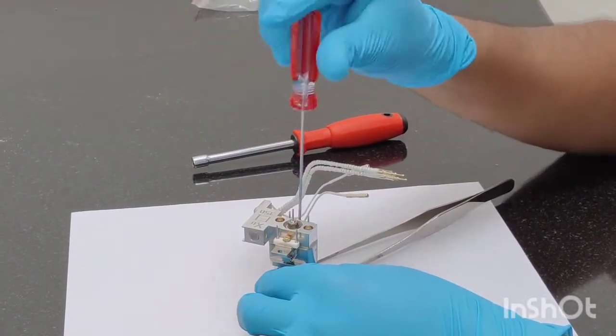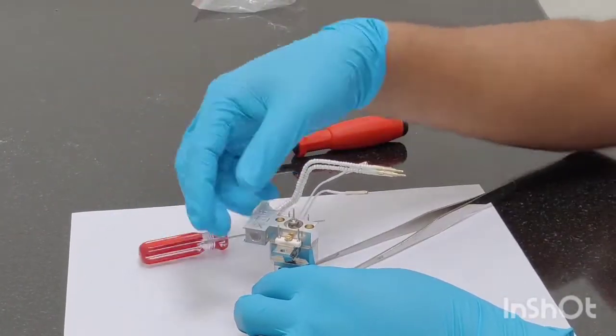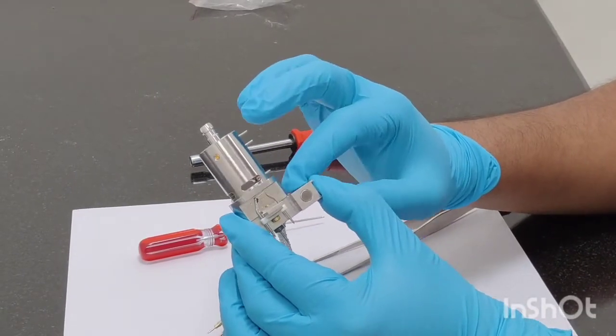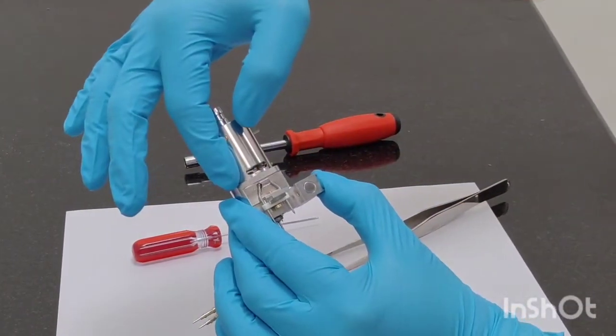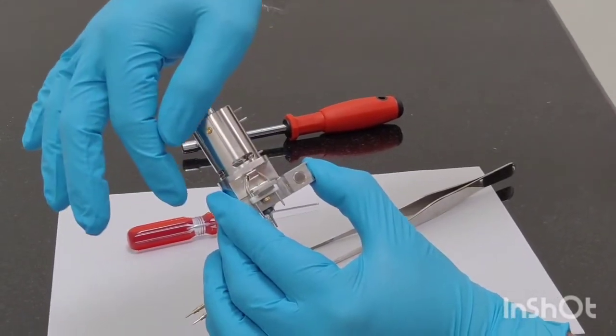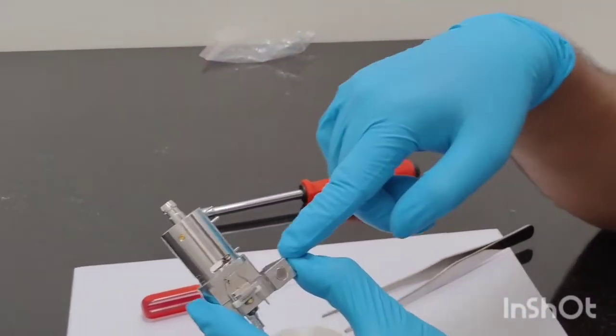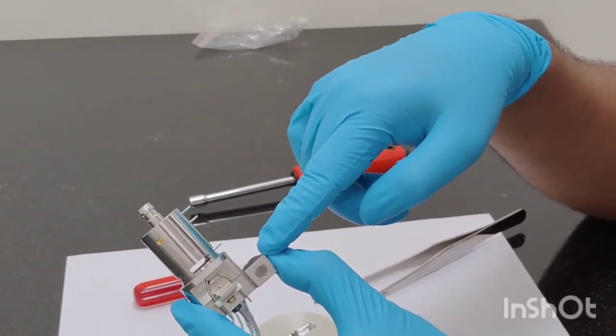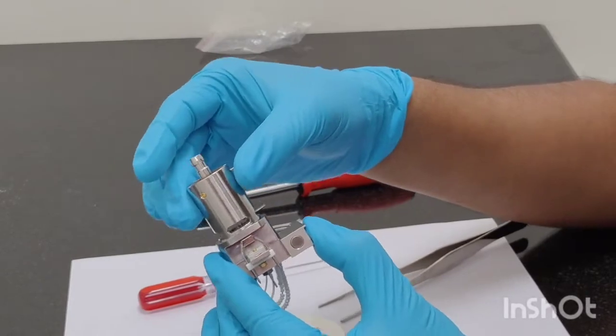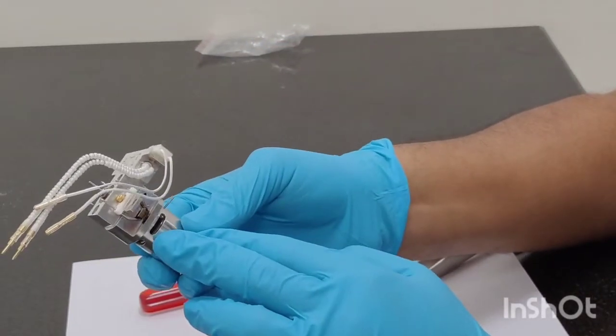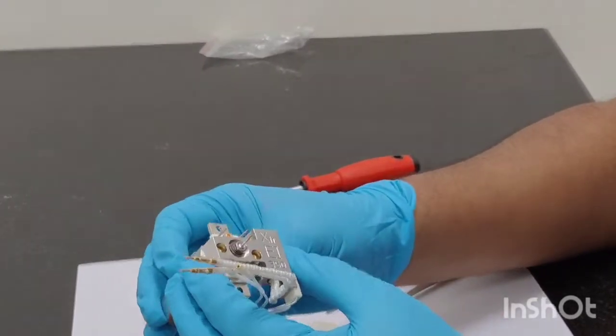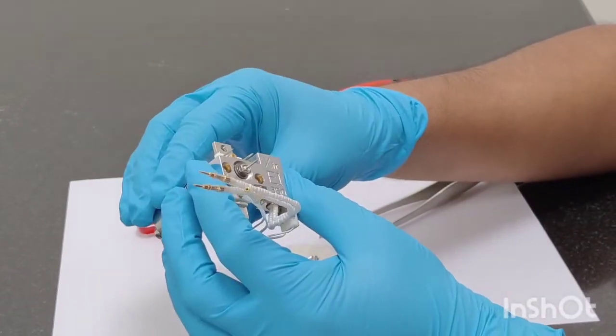One common mistake which happens when we are refixing the filament assemblies is this: that instead of facing the filament portion inside, some of the time we reverse this portion and the filament portion will be facing outside the ion source body. So that is the wrong way to connect. This is the way we have connected, that the filament is facing inside the ion source body is correct. You can see both the filaments are fitted correctly and you have to remember this, this is a common mistake which may happen.